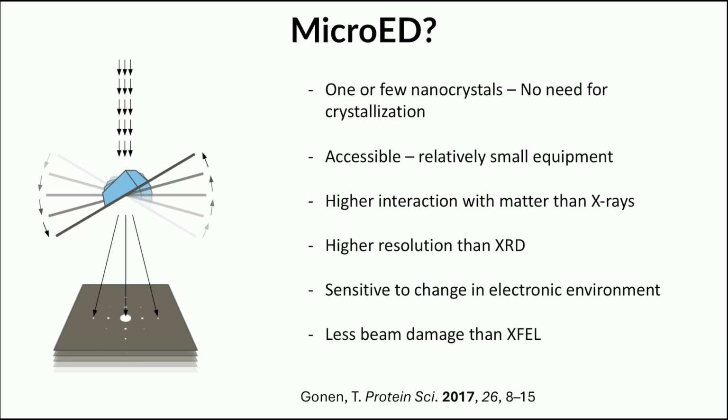So what about microelectron diffraction then? In theory, we need only one or maybe a few nanocrystals, and we don't need the crystallization process because we can usually have these in crystalline solids. This technique is accessible, just like TEM.